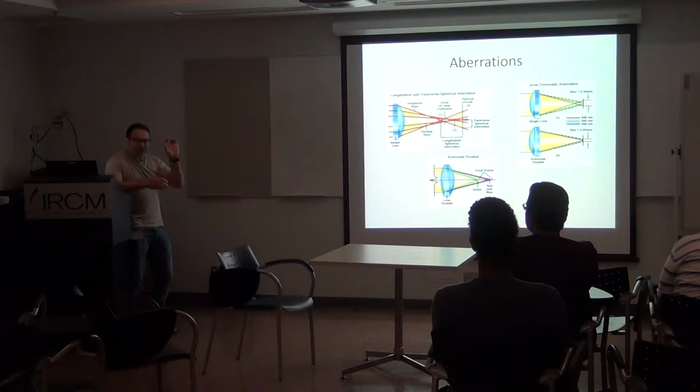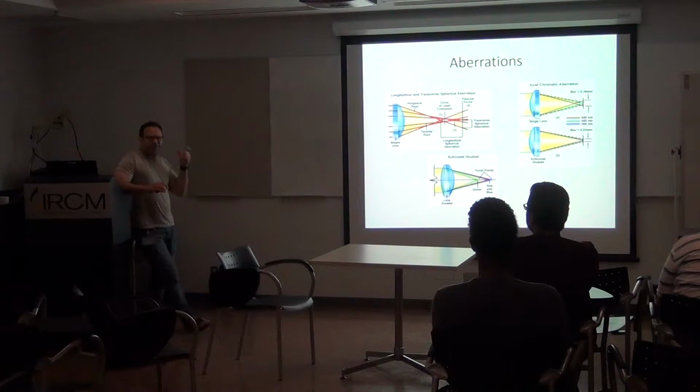If you play with a high zoom and you do not have really good quality of lens, you're going to see maybe at the edge some colors which look strange.